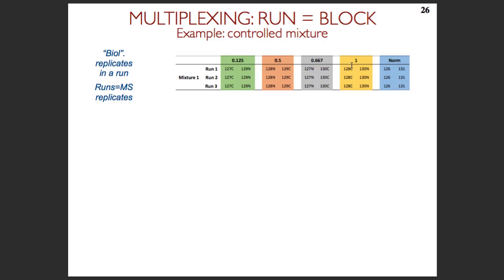So just as before, we have a complex background, and we have multiple proteins spiked in at these concentrations. So for a particular protein, we have 4 different concentrations here on some arbitrary scale. And the characters inside are the channels to which we have this particular concentration assigned.